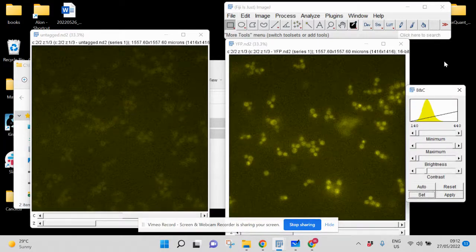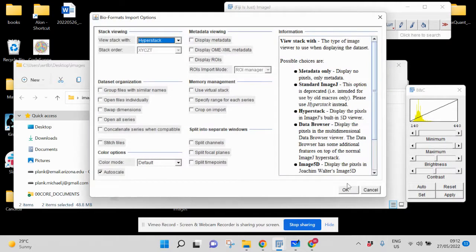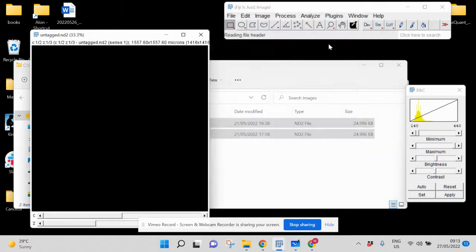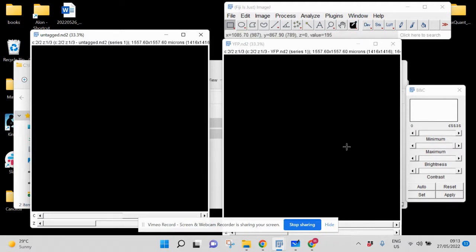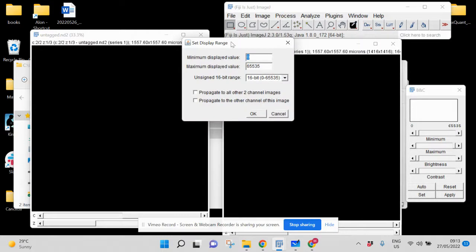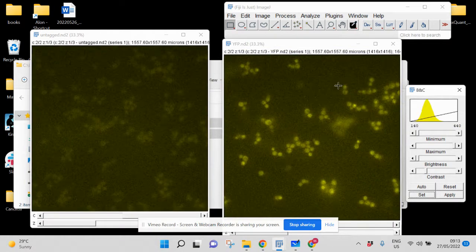This is essentially the solution. However, keep in mind the actual pixel intensities haven't changed. If we close and reopen the images using default settings, go back to the YFP channel, it will appear black — ImageJ remembered we wanted 16-bit scale but forgot our display min/max values. We need to go back and re-enter those display values. Let's apply them to both images at once, and we're back to the result we wanted. You can now export these images for your figure.